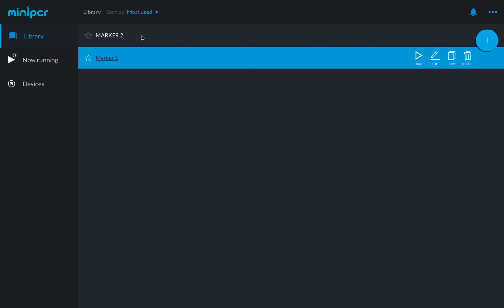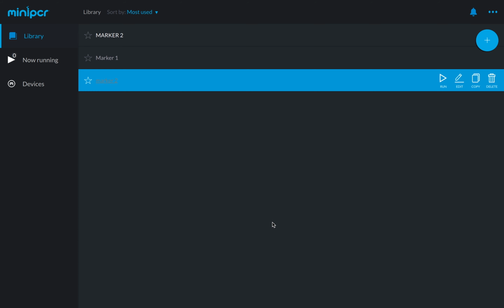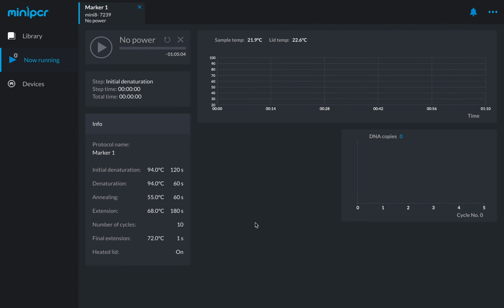Okay, so here is my program, and I'm going to add a PCR and name my protocol. And there are spots to change the temperature and time in seconds for denaturation, annealing, extension, and then the final extension. And then you can control the number of cycles here at the bottom. The only downfall with this program is, say you have to run your experiment at 2 different cycles of denaturation temp and then a different denaturation temp, you would have to make 2 different PCRs. So I have marker 1 and marker 2 for that.